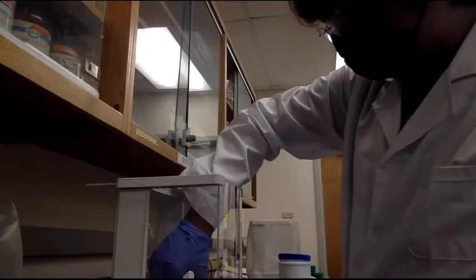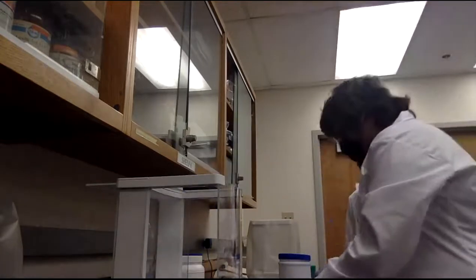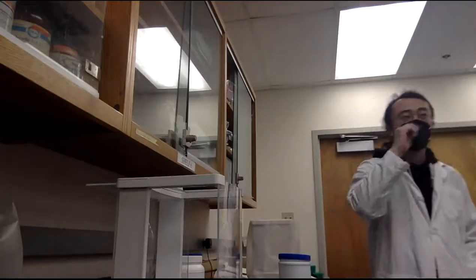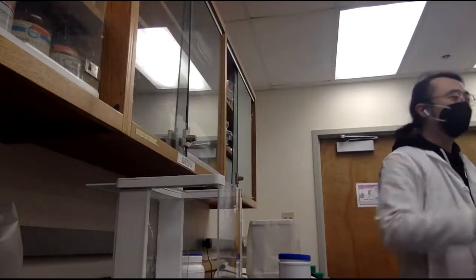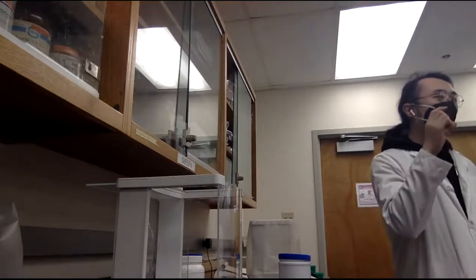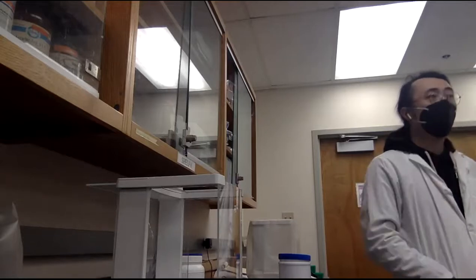I think these beakers are too big for you. You just need to make 50 ml, and these are about 250. So if you look at the side, the level of your solution will be too low. And when we are measuring the actual pH after this, you need to make sure the probe of the pH meter is covered better. That one looks better.